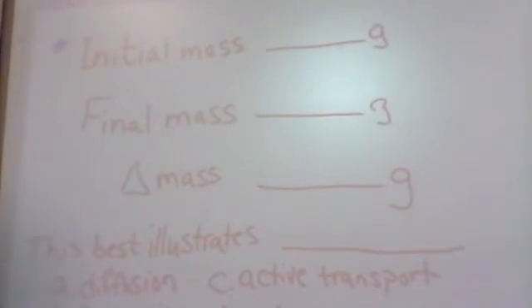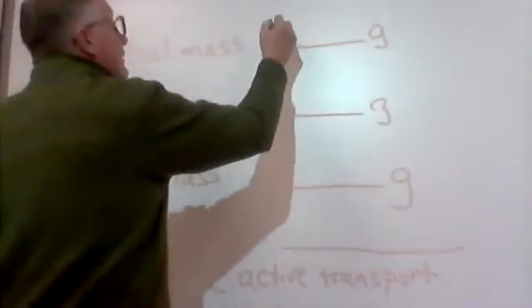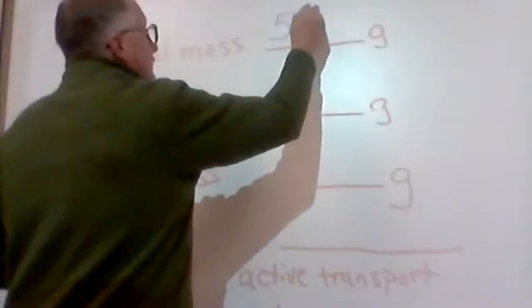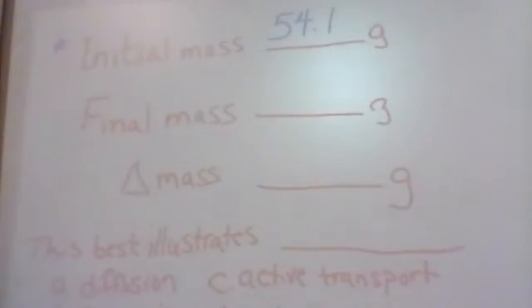All right, so hopefully we got this in. What was your initial mass? 54.1. 54.1 grams, and now let me get that. And do you guys have a couple of pieces of paper towel, because you're going to want to dry it off.